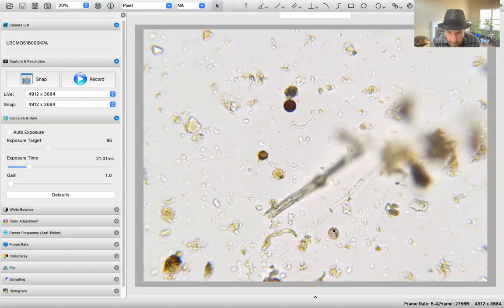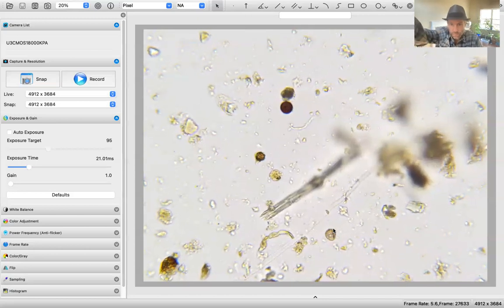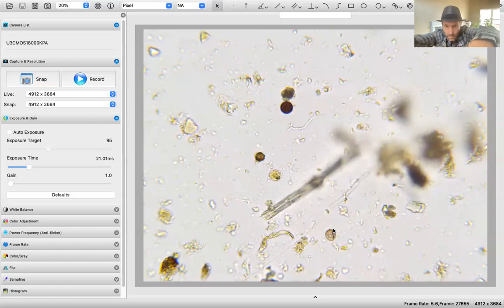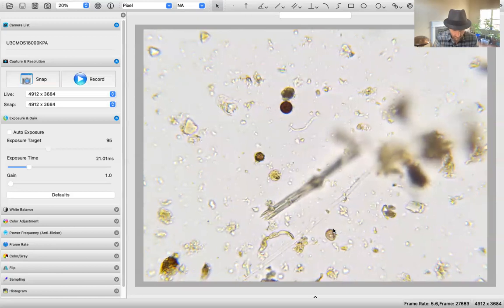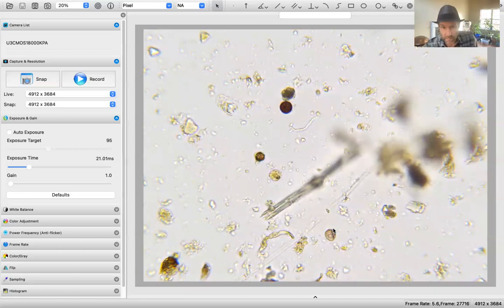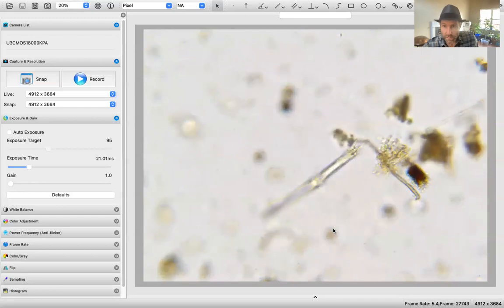It looks to be about 5 or 6 micrometers wide. I'm going to verify that in just a second. And as far as the length goes, don't lose my board. Length. I'd say 5. Let's see, 1, 2, 3, 4, 5. It's actually 6. Let me make sure it's not longer. Oh, it is longer. It's going all the way up.